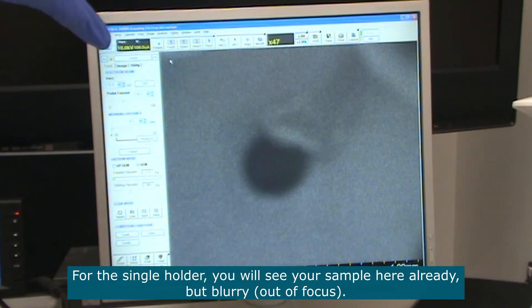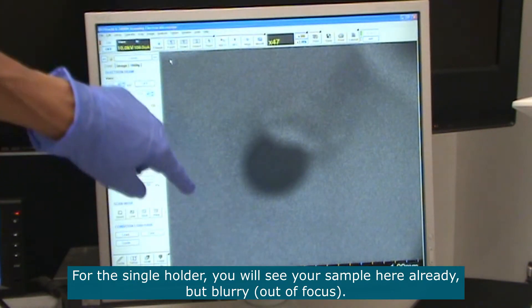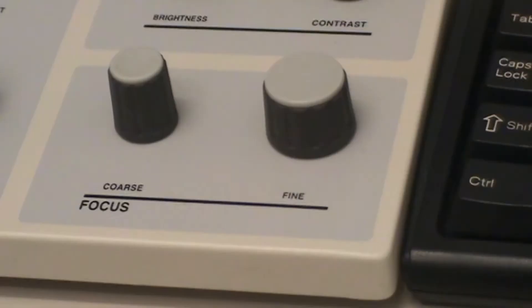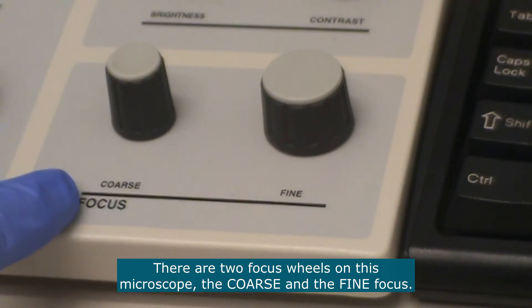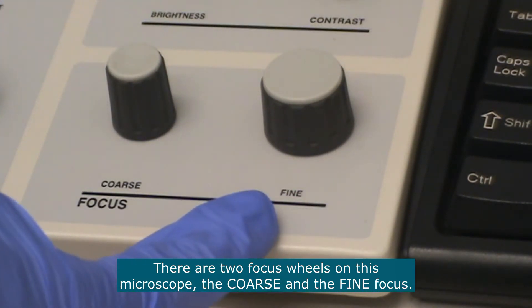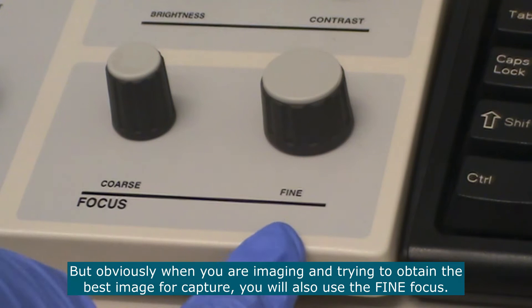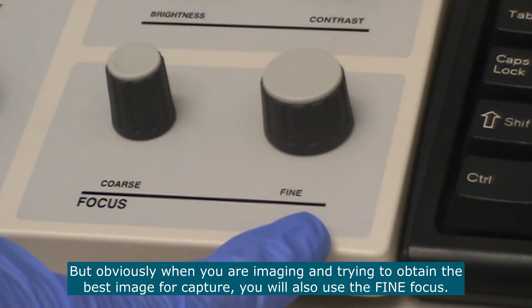If you have a single sample inserted in a single holder, you will actually see your sample here already, but blurry. There are two focus wheels on this microscope: a coarse focus and a fine focus. For the moment we'll use the coarse focus, but when you are imaging and trying to get the perfect image for capture, you will also use the fine focus.